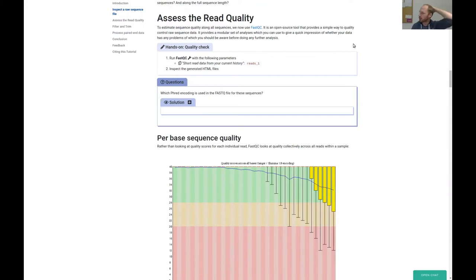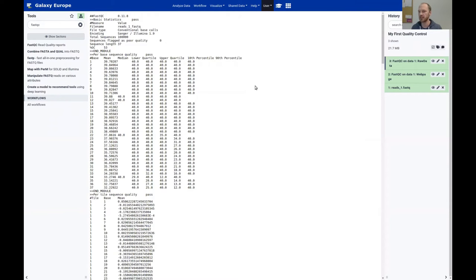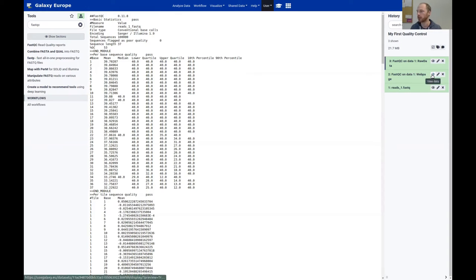Okay, let's come back. If FastQC has run, you'll see two files in your history: one web page file and one raw data file. We can look into the raw data — it's basically the raw data FastQC uses to generate the plots. If you want to see the data behind the plots, you can look into the raw data file, but this is not important for now.